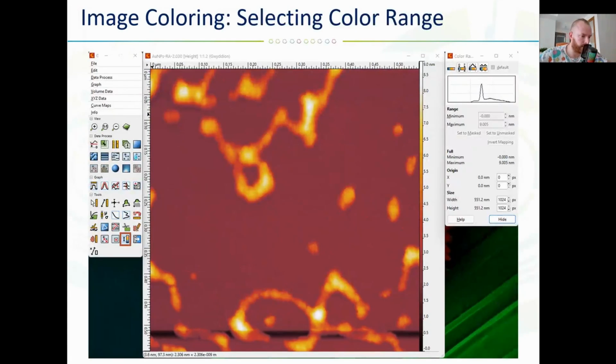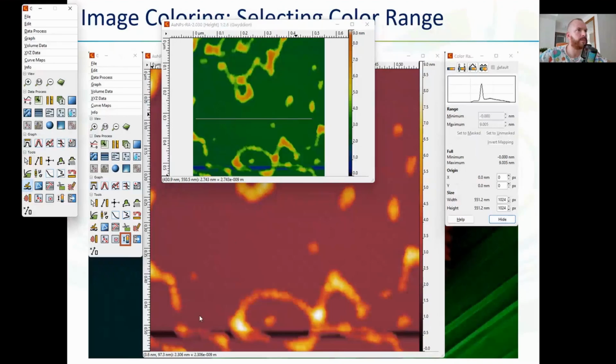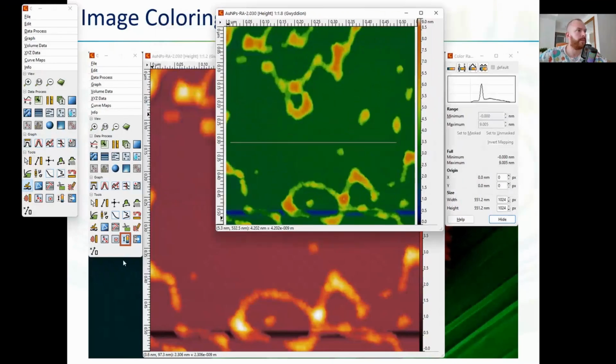Another tool to make these colors more visible, I would say. There is a button, as it's marked here, you see. Again, if you forget something and you do not know where to get all the ideas and so on, in the presentation, every button that I talked about today is marked in a red square.